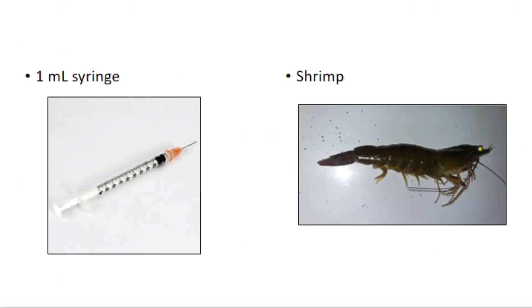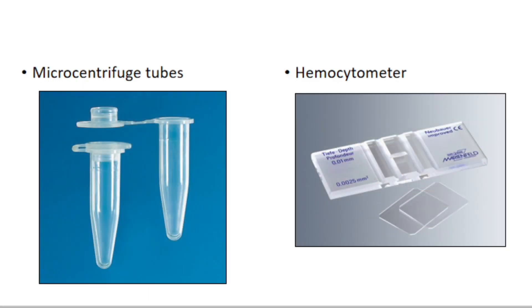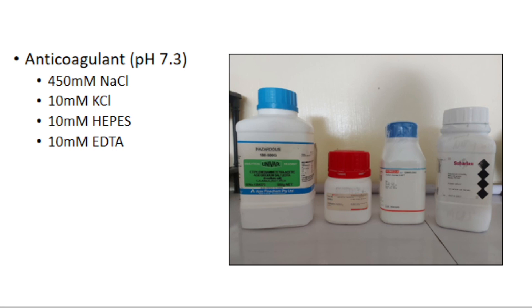In hemolymph extraction and total hemocyte count determination, we need the following materials: a 26-gauge 1 mL syringe, shrimp, microcentrifuge tube, hemocytometer, and anticoagulant containing 450 mM sodium chloride, 10 mM potassium chloride, 10 mM HEPES, and 10 mM EDTA adjusted to pH 7.3.